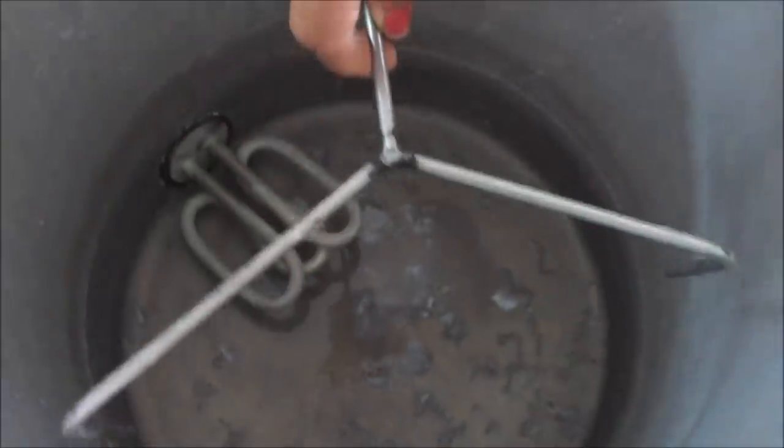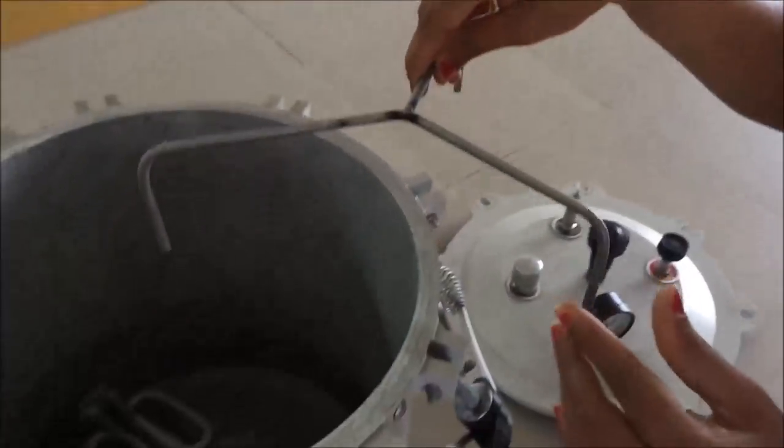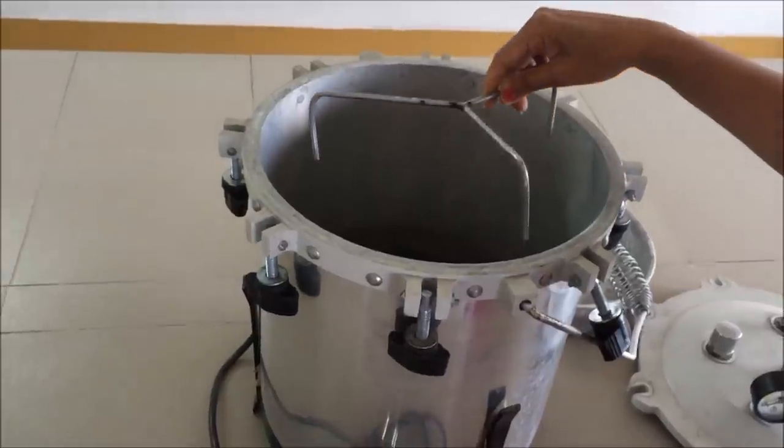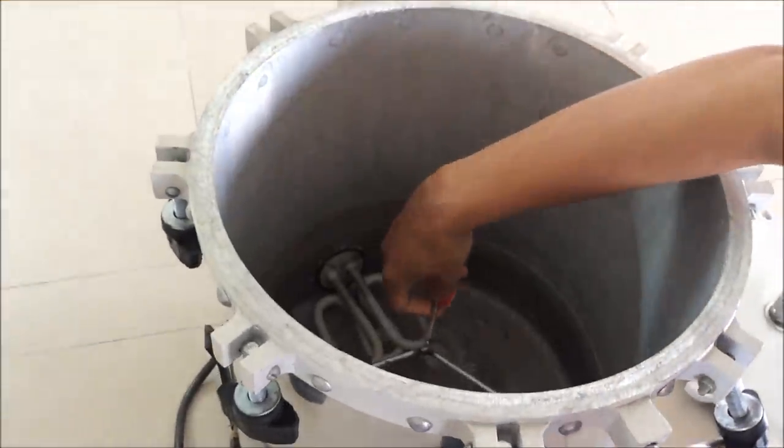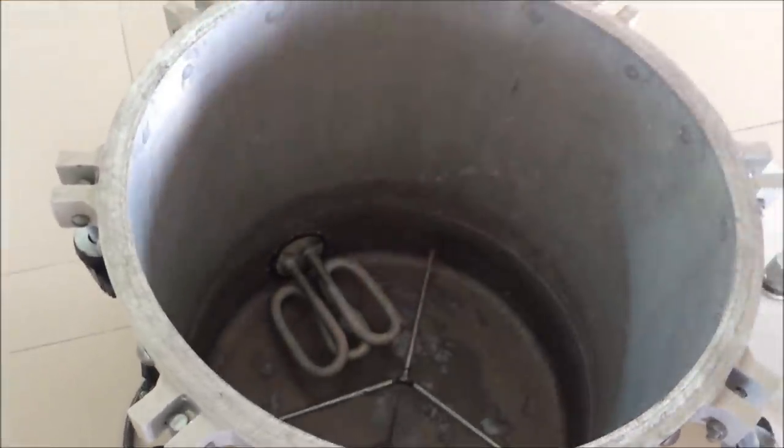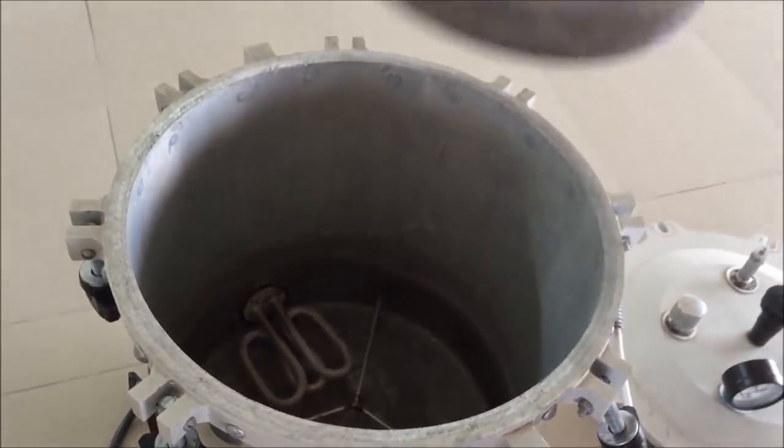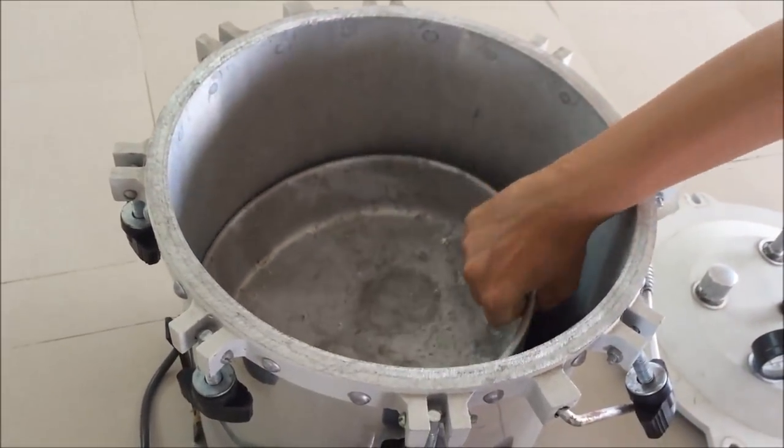First is a heater which allows to convert water into a vapor by heating it. And this is a tripod stand which serves two main purposes. First to keep a safe distance from heater to the tray. And second it gives the indication about the level of water.